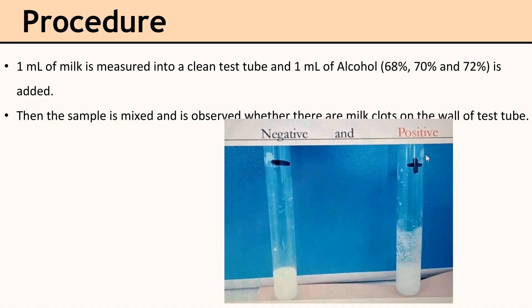Now let's see how to do the alcohol test. One ml of milk is measured into a clean test tube and 1 ml of alcohol is added. We can use 68%, 70%, or 72% alcohol. Then the sample is mixed and observed whether there are milk clots on the wall of the test tube.